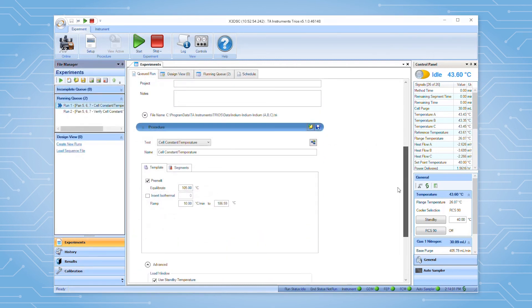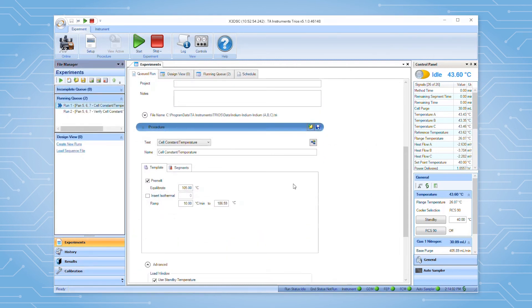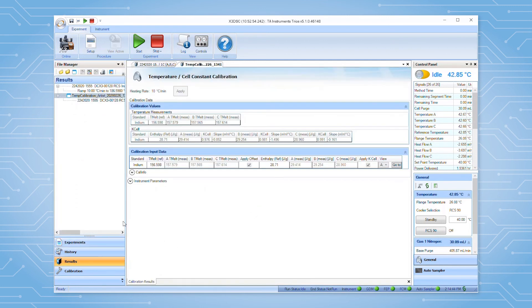After the tests are complete, TRIOS will automatically generate and apply the cell constant and temperature calibration. Once applied, the calibration information will appear in the calibration data page.